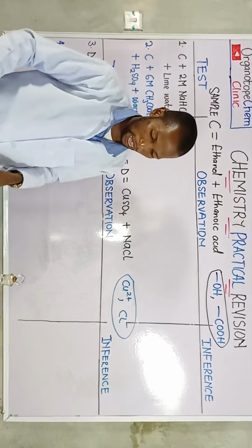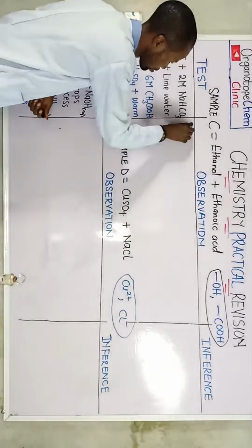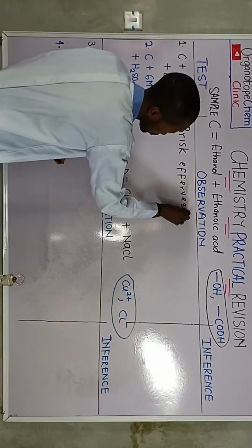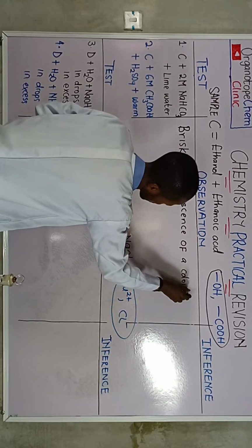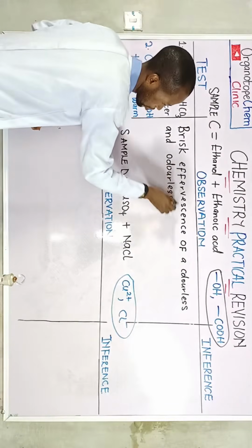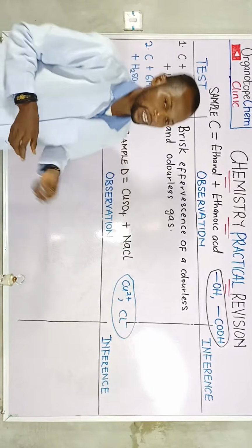So I'm going to have the observation now. We have brisk effervescence of a colorless and odorless gas. Okay, brisk effervescence of a colorless and odorless gas.